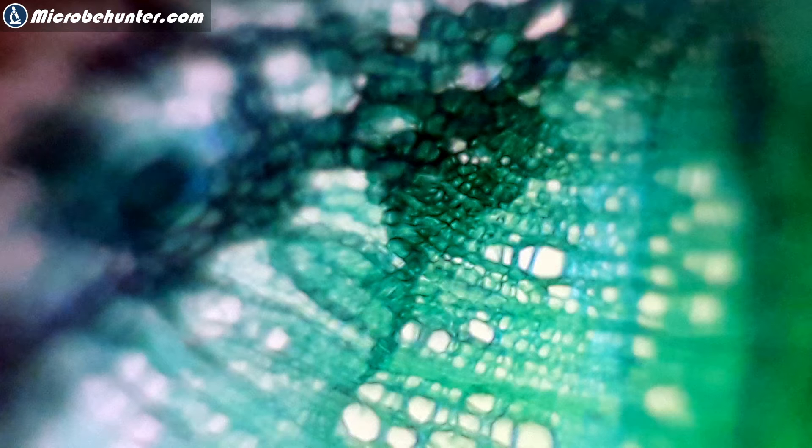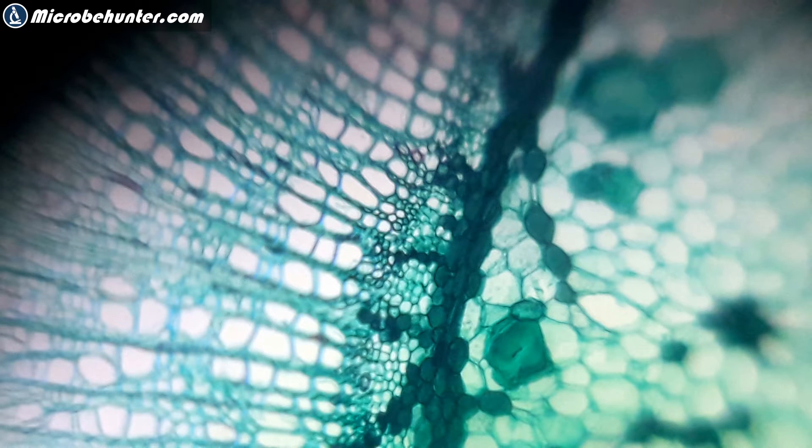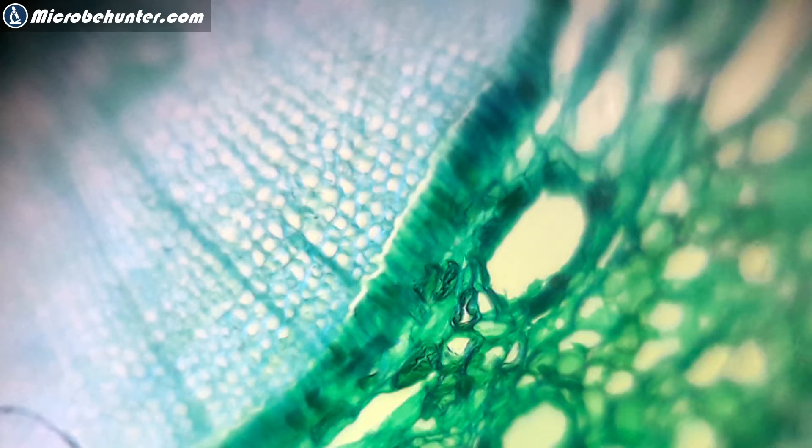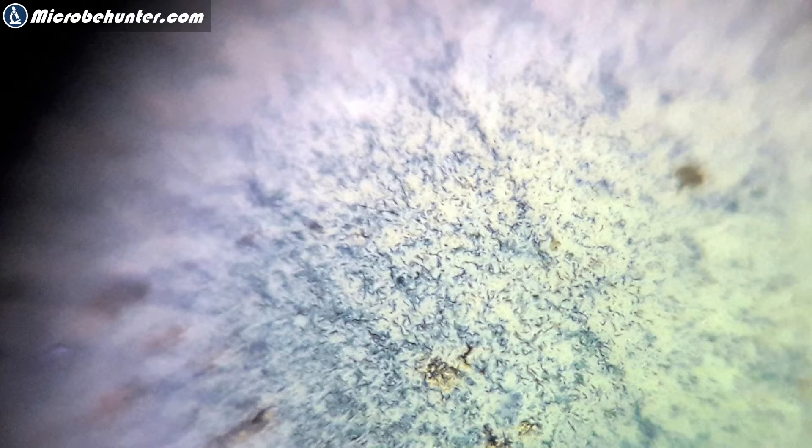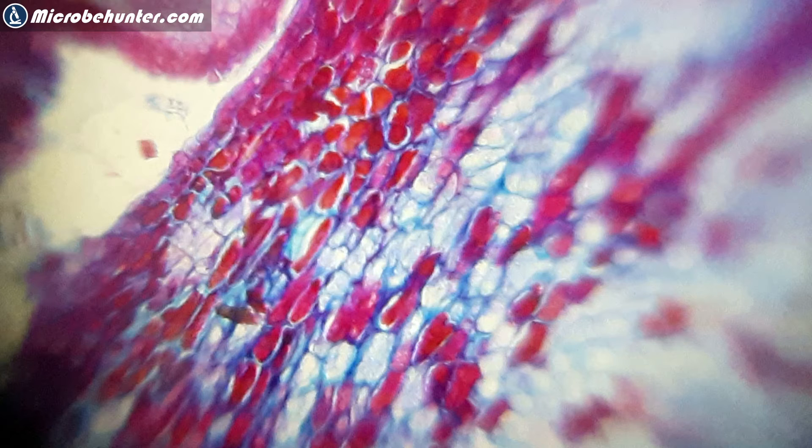These are now pictures of permanent slides that I had at home. And I held them in front of the Foldscope. And then I tried to take a picture using my mobile phone. And there are various plant tissues, of course. This here is an onion from an onion skin. And you can see that the image is quite blurry on the edges, just like expected. I also cropped away some of the parts because, of course, the hole is quite small. These are bacteria here. Okay, those little dots. These are the individually stained bacteria, as I promised. So you can see them. Not quite as clear as one would hope. But still, it is possible. And that's the head of a dog flea. And I think with that, I think I'm going to call it quits for now.